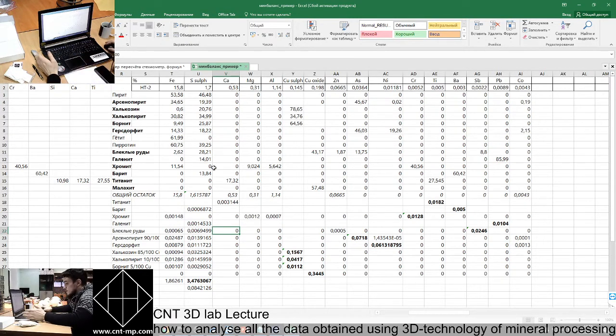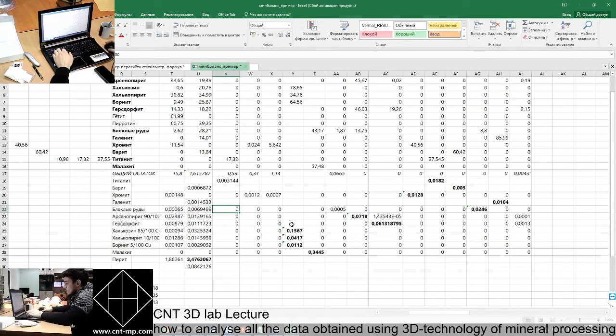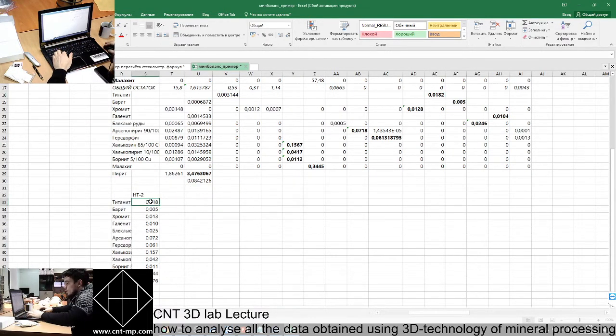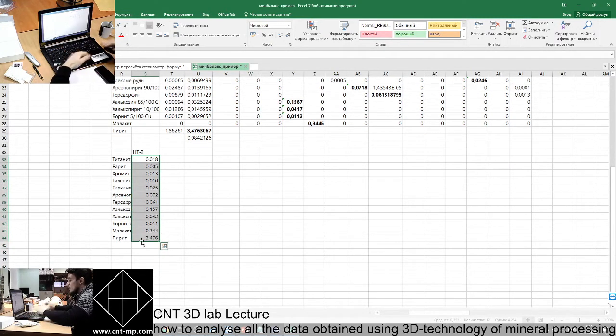And once again, the main advantage of such an approach is that we can work with a content of less than 1%. And also I have to mention that the percents we're talking about are counted for the whole balances.